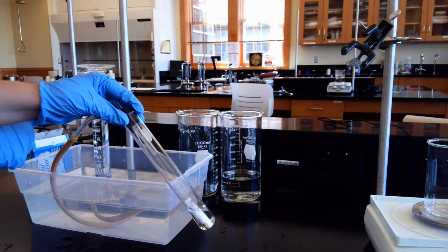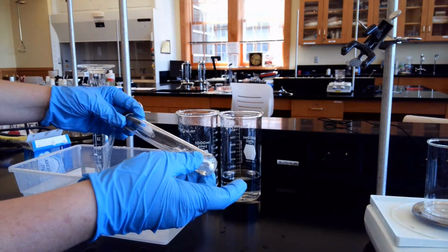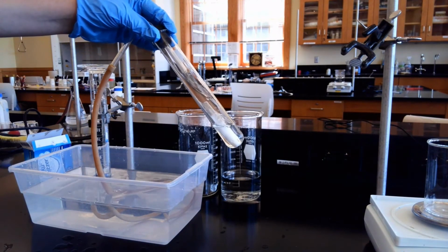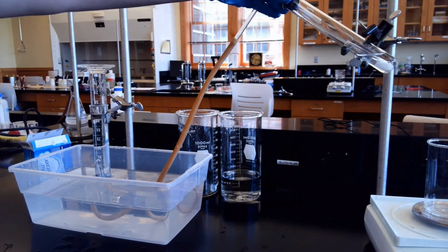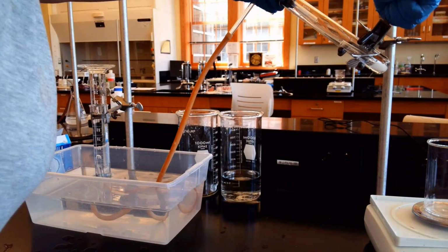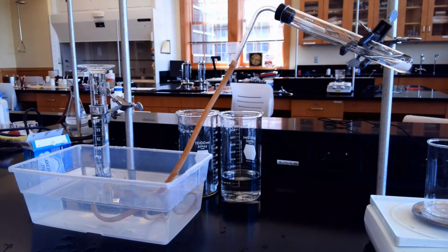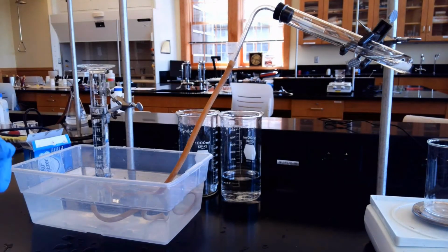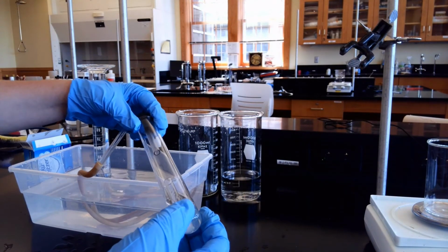There goes the gas, traveling up through. And we want to keep agitating till all of our material is used up. And we can sit it in here to just sit for a second. It looks like we still have some solid, so we're going to agitate some more. And we can use our hands to do that.